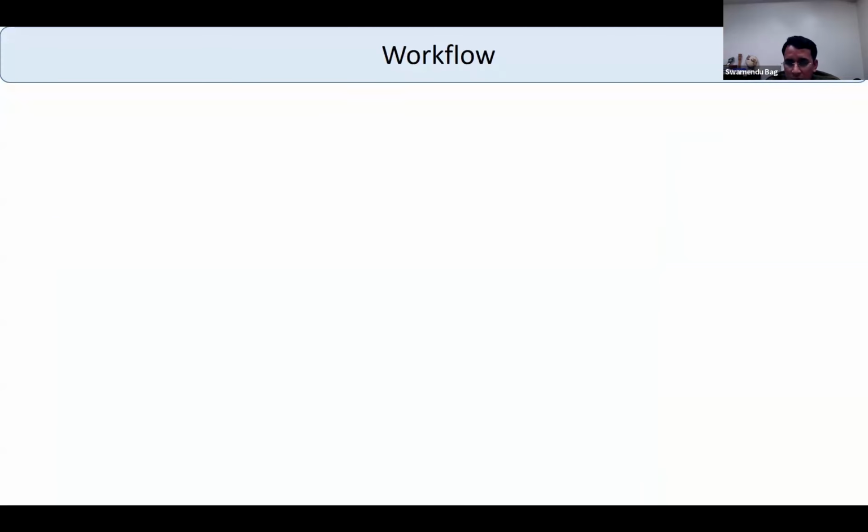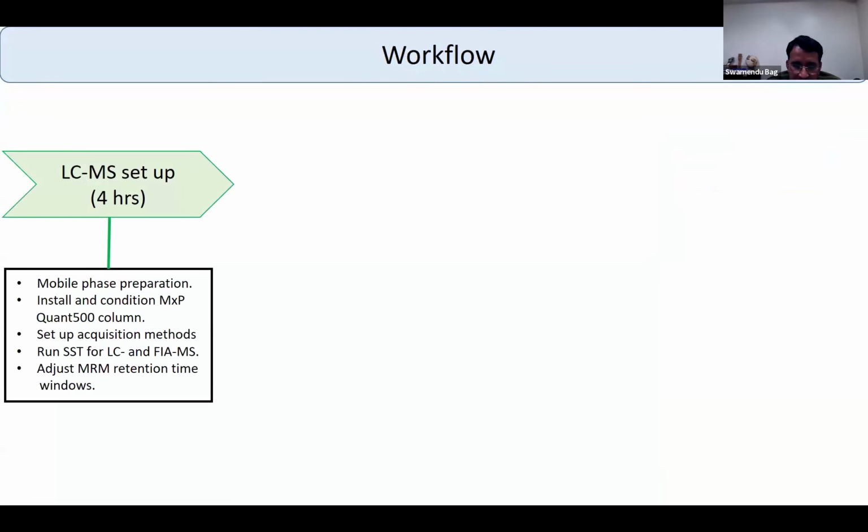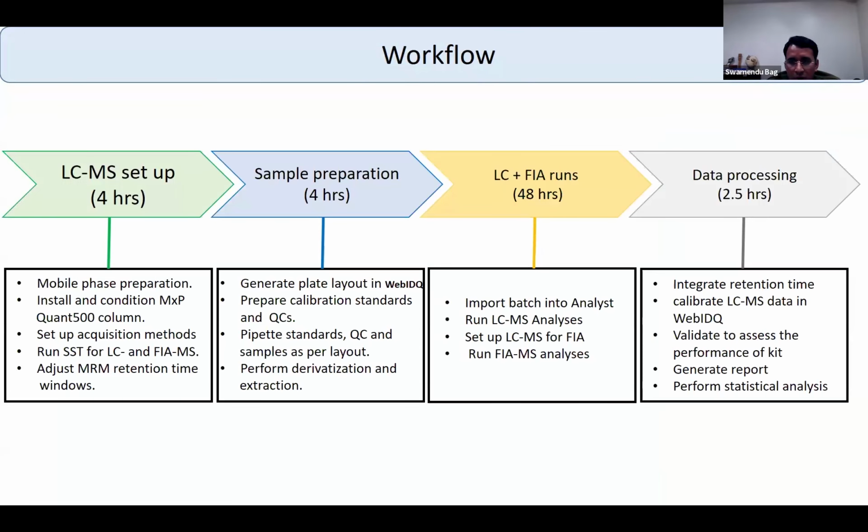So if I'm not discussing the detailed workflow, just a snapshot. In one plate, it will take around 58 to 60 hours to complete a run. We can divide the workflow like this: the LC-MS setup.